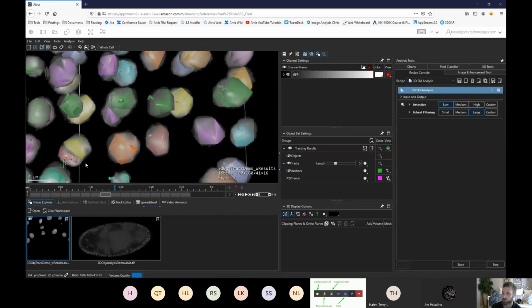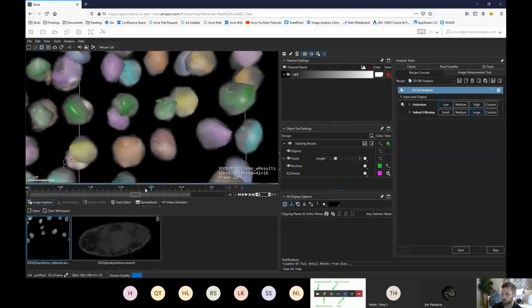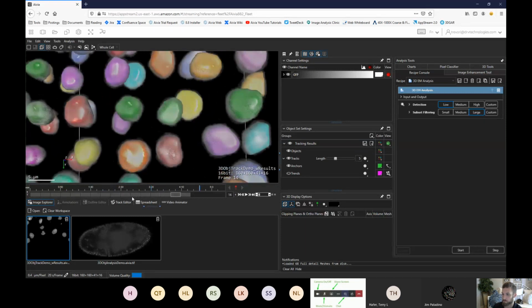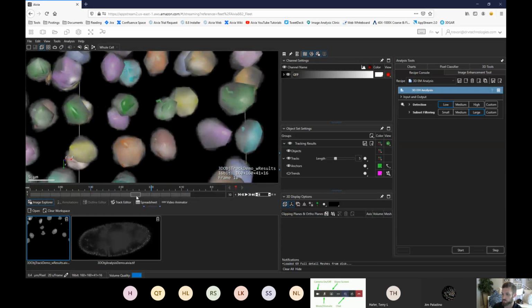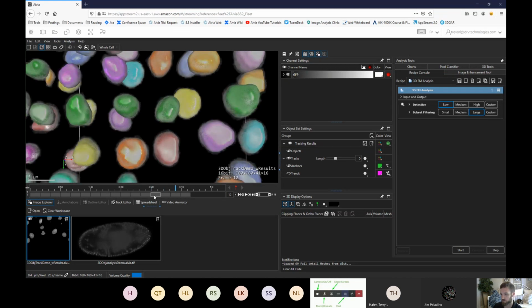Hopefully that worked for everyone. You'll notice the time slider is still there, where you can click and drag and switch through the time steps and watch these objects move in 3D. You'll notice on my screen, maybe if you're watching it, these objects look a little choppy when I play through. So watch whenever I move to this next time step. We see the objects are first displayed from a low resolution mesh, and then once I stay on this time step long enough, the full resolution mesh is loaded into memory. Whenever I switch back, it happens again.